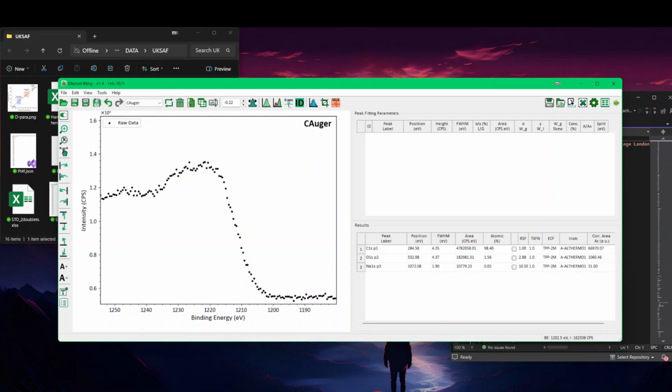But here I have also a window called the D parameter. So I can measure the D parameter. I could, if I really wanted to, measure the D parameter by first smoothing the data and then applying a derivation. So that will give me the maximum curve here and the minimum plot here.